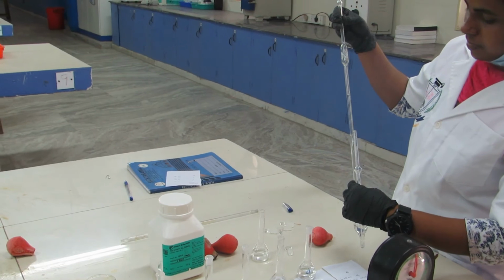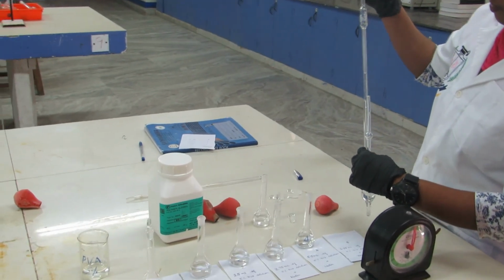The procedure is the same for all the measurements; only we are varying the concentration of PVA.